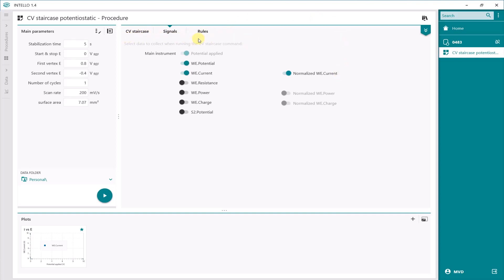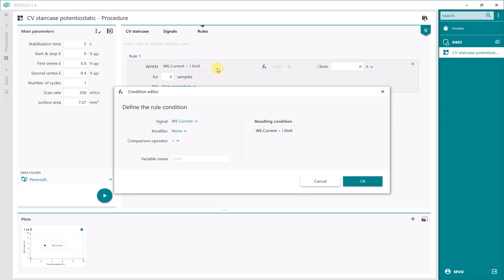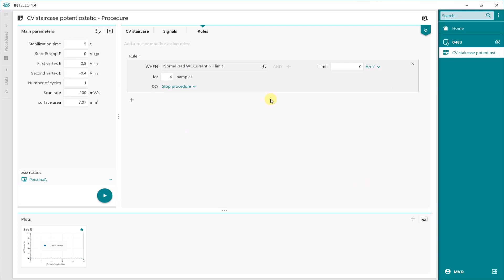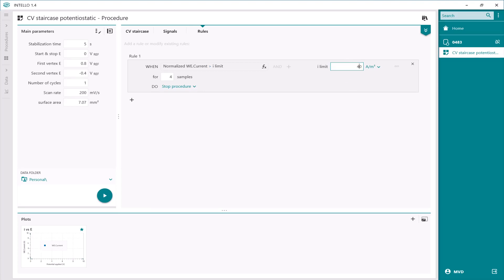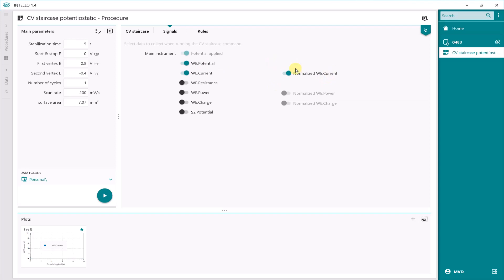In the CVStaircase command, you also see the rules section. You can add a rule — for example, if the current density becomes higher than a certain limit. You select the signal — normalized current — and when the current density becomes bigger than a certain value, you define what the software needs to do: stop the procedure or stop the command. You can fill in, for example, 40 amps per square meter, or 4 mA per square centimeter. Here you define the limits for the current density and what the software needs to do. We do not apply this rule in the current example, so we have the current and the normalized current.